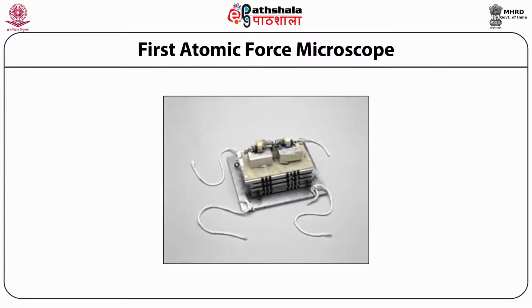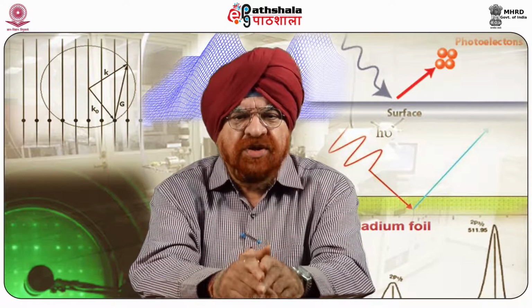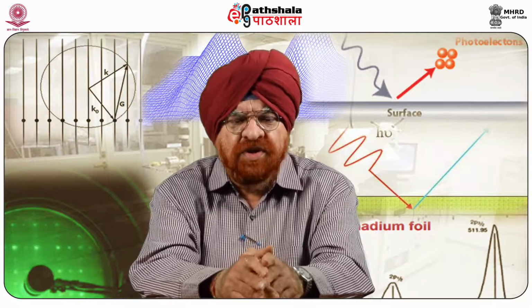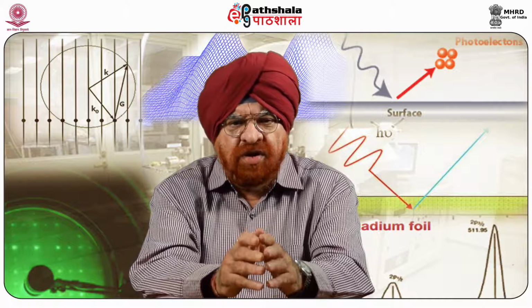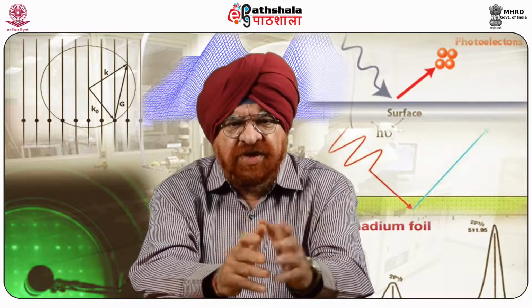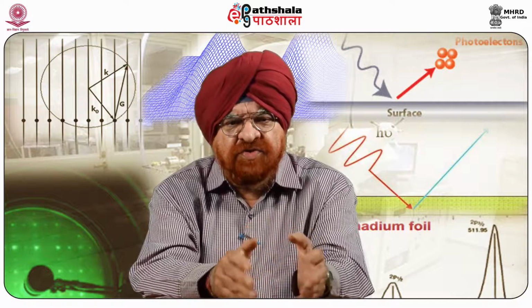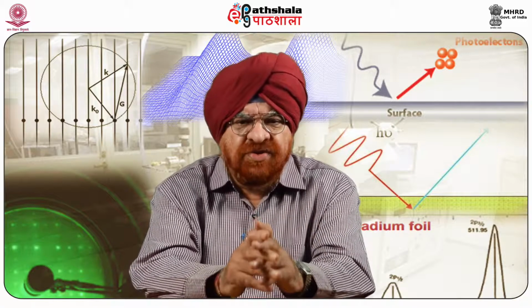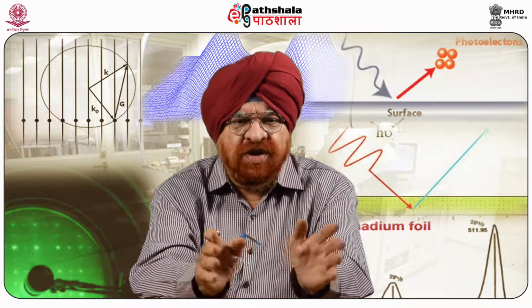It is very clearly shown here that this is not a very big sized equipment, but is a very useful one. Now we will discuss the history of atomic force microscopy. In 1986, by Binnig et al., it was developed in the first stage, and then the first atomic force microscope was developed also. Since then, the AFM has undergone continuous development in all areas.